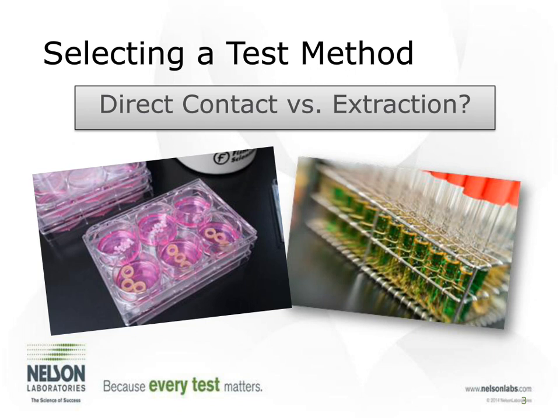And if it's a gray area, if you're a little unsure about which test method to choose, remember the extraction method generally is more sensitive than a direct contact. So we try to lean more towards the extraction method for most of the devices because it is worst case and it does mimic the most representative devices out in the market.